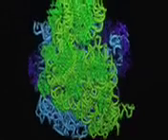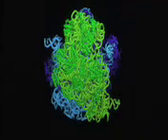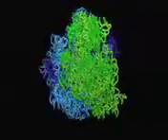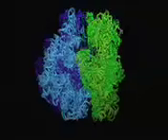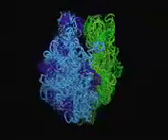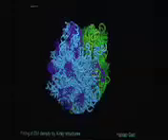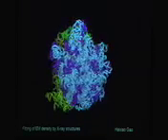And one can make atomic representation of the two different states by flexible fitting of X-ray structures. And then one can depict these kinds of internal molecular reorganization on the atomic scale.